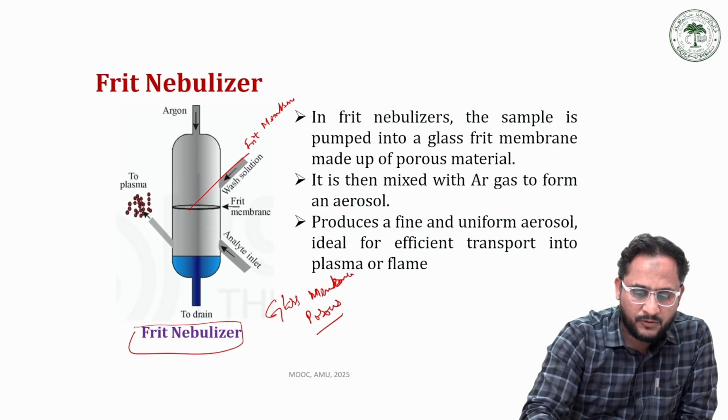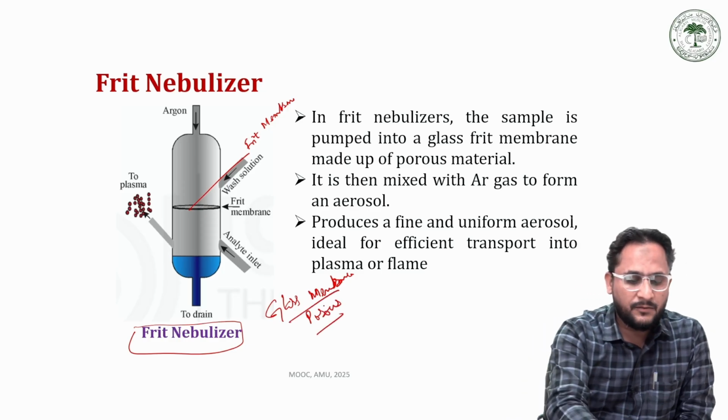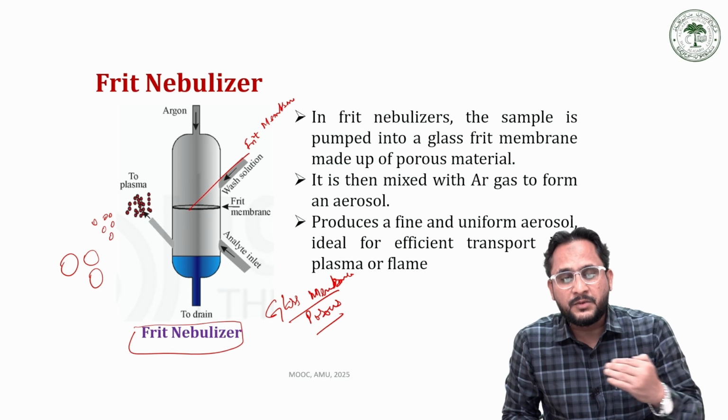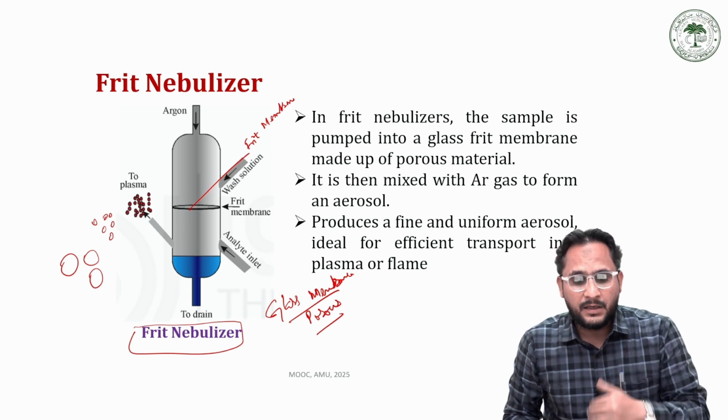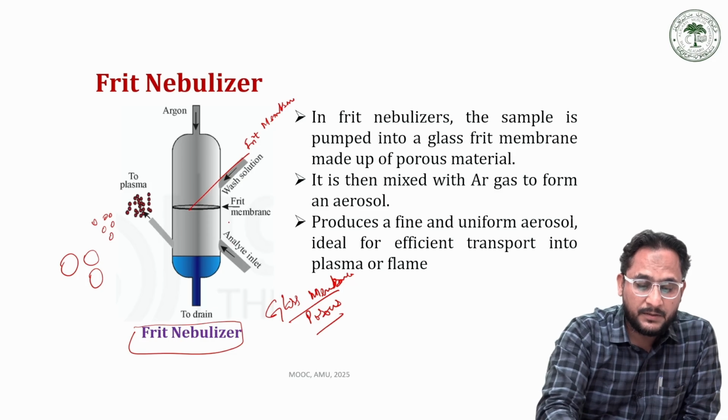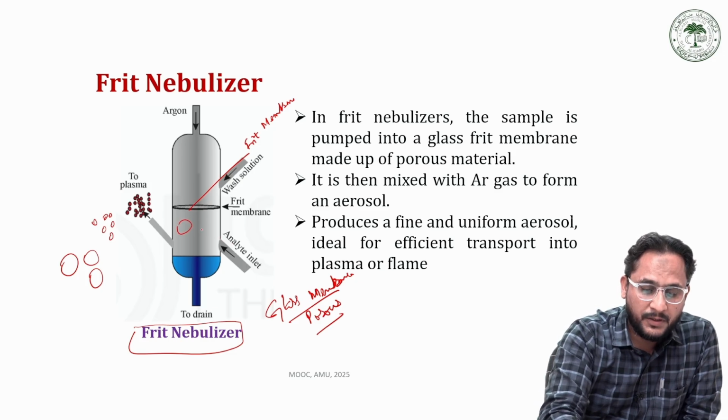So when the sample is passed through these pores, the sample forms very small droplets, and then it is mixed with the argon gas. Here we inject the sample from the bottom, and the sample is pushed through this membrane to form these droplets of the sample.